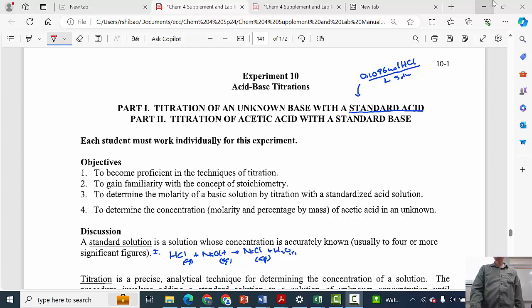And what do people use that for? Well, people use that for comparison, or for testing methods. They have gold standards, this standard, that standard. So we're going to use this. This is just a standard that was produced in the lab here. And so we know what the composition of this acid is. It's hydrochloric acid here. And this hydrochloric acid standard, I mean, this looks like water, but it's just HCl dissolved in water. We're going to get it from the stockroom.